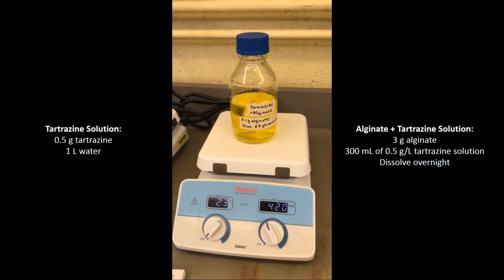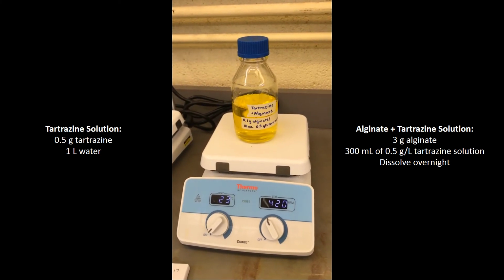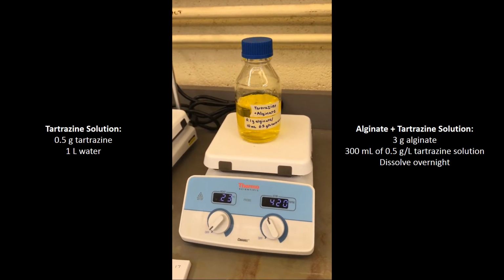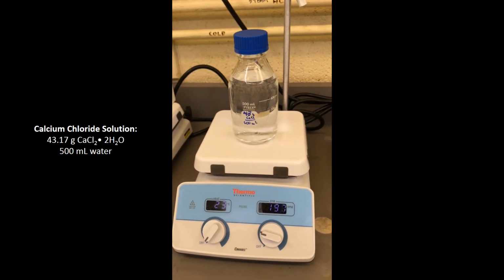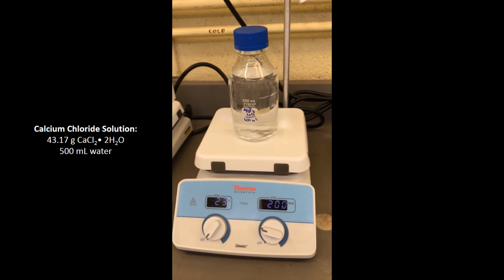0.5 grams of tartrazine was dissolved in 1 liter of water to make the dye solution. Then, 3 grams of alginate was added to 300 milliliters of the dye solution to make a stock solution of the alginate and dye. The calcium chloride solution was prepared by adding 43.17 grams of calcium chloride dihydrate to 500 milliliters of water.